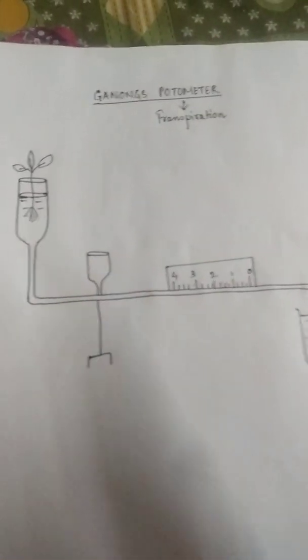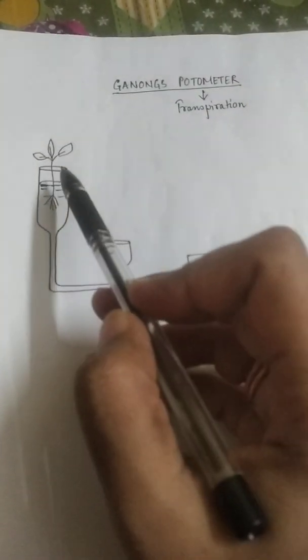That means whether a plant is transpiring very very fast or whether it is a slow transpiring plant. So this instrument is called a potometer and it is designed like this.